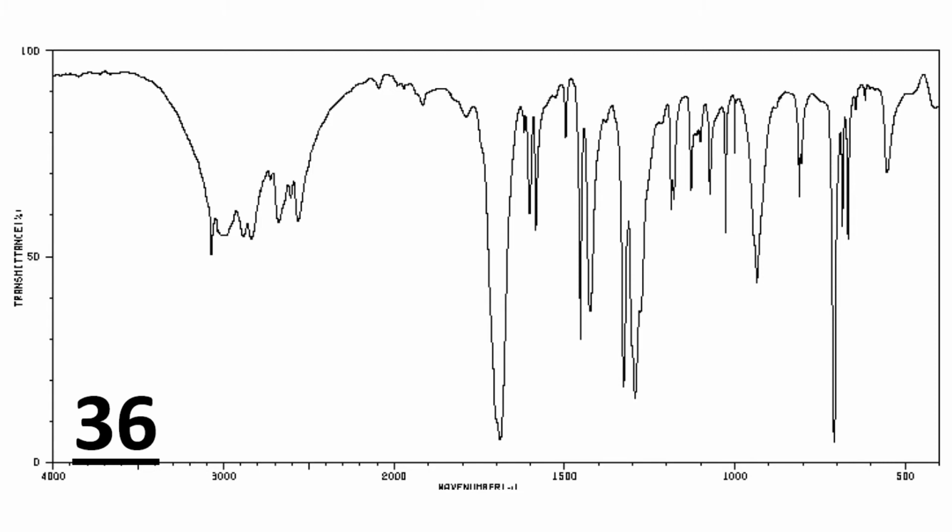Hello chemists, we are going to be going over some tips and tricks for properly identifying the presence or absence of various bonds on infrared spectrographic printouts like this one. When you approach one of these that you haven't seen before, your first step should be to look for the four most useful types of bonds to identify the presence or absence of. Those are your N-H, your C-H, your O-H, and your C=O. Whether those are present or not is going to tell you a whole lot about what sort of molecule you are dealing with.